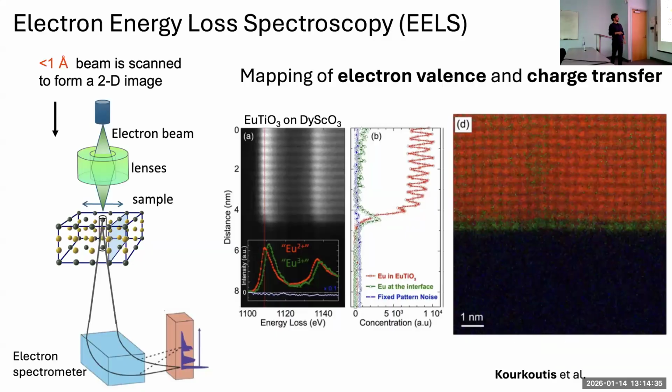Now, with these electron energy loss techniques, I should also say, and I apologize for this, I flipped the diagram. Until UBC, all my microscopes had the gun on top, so I usually thought of the electron beams going down. The first diagram I showed you was going up, so just keep that in mind. But this is the same diagram, just flipped.